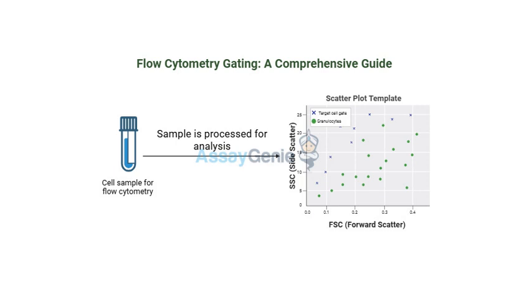Yeah. Imagine you're trying to listen to the radio, but there's another station on a close frequency, and it's bleeding through, making it hard to hear clearly. That's basically what fluorescent spillover does. Oh, I see. So it's like two witnesses talking at the same time, and it's hard to understand what each one is saying. Exactly. Let's say you're using two different antibodies, one tagged with a green fluorescent dye, the other with a red dye. If there's spillover between the green and red channels, it might look like some cells are expressing both proteins, but actually they're only expressing one. Ah, so it's like a false confession because of the overlapping signals. How do FMO controls help with that?